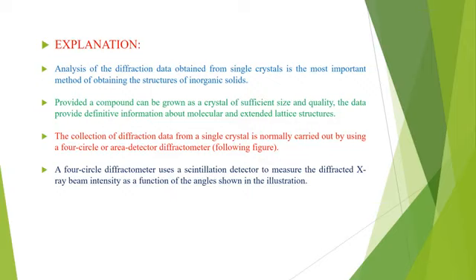The data provide definitive information about molecular and extended lattice structure, provided a compound can be grown as a crystal of sufficient size and quality.